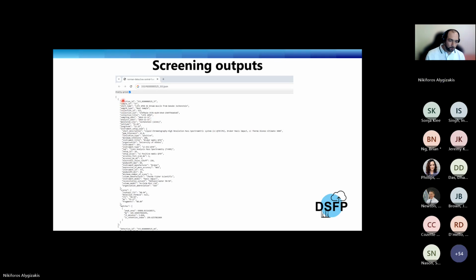Again, the way it is structured, it gives us some information about the compound, some information about the collection and the sample, and then it gives us the matches and the scores, the evidence we have that this is the specific compound. When a curly bracket starts, then a curly bracket ends, and then we have the next sample. So this can be a pretty long text file.